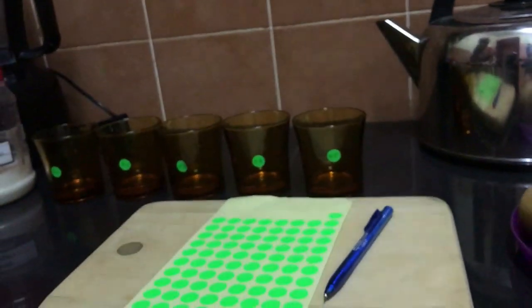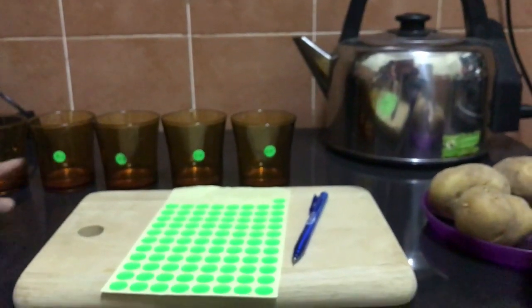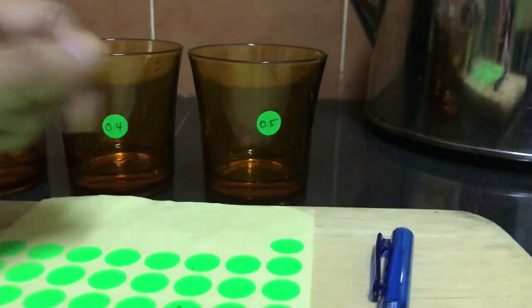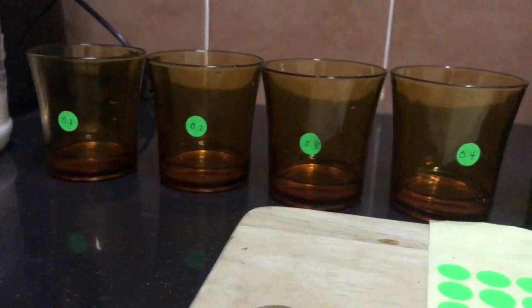Now you have already made different dilutions. For the 1 molar sucrose stock solution, you have already prepared 0.1 molar, 0.2 molar, 0.3 molar, 0.4 and 0.5 molar of sucrose solution. So we have 5 different sucrose solutions.